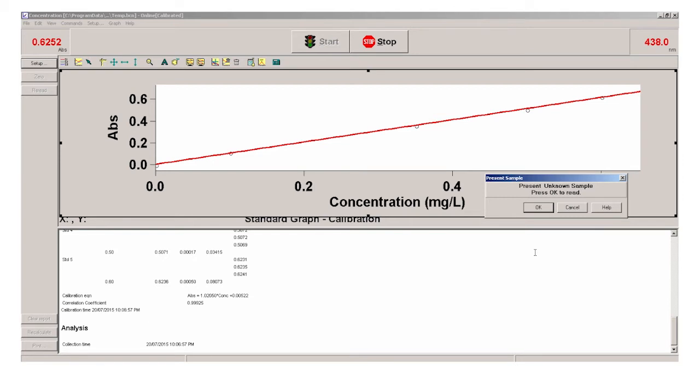And as you can see, a very large number of samples can be measured in a very short period of time.